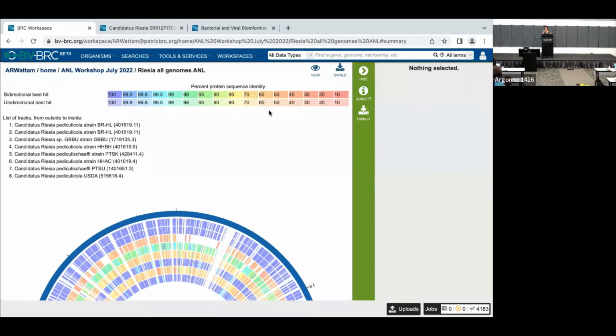Or if they were virulence factors that are really important, like maybe toxin genes or something that you really care about and you want to see, first of all, if they're there, but also this will tell you there's an indication of it here in the strength of the BLAST hit. But it can also give you a sense when we dig into the Excel file that comes with this, it'll show you sequence identity and coverage so that you get a sense where these genes are falling apart too and things.